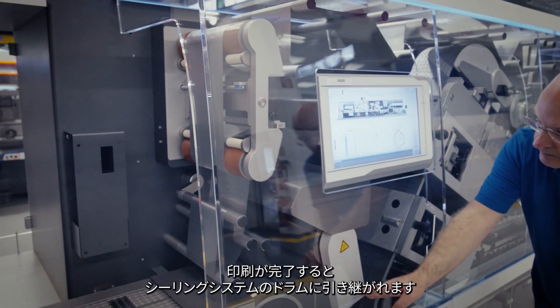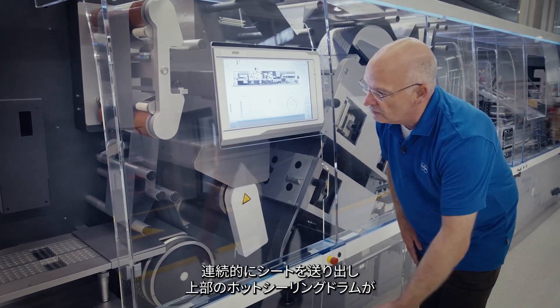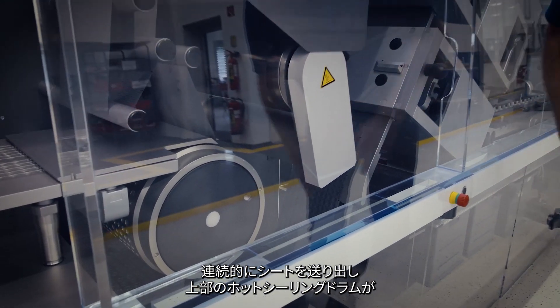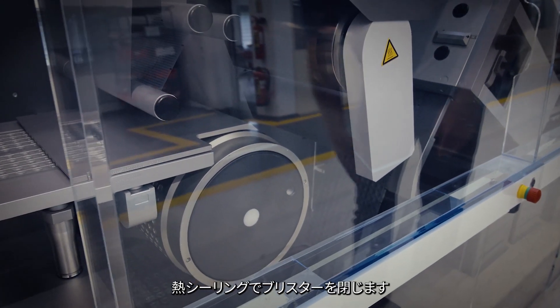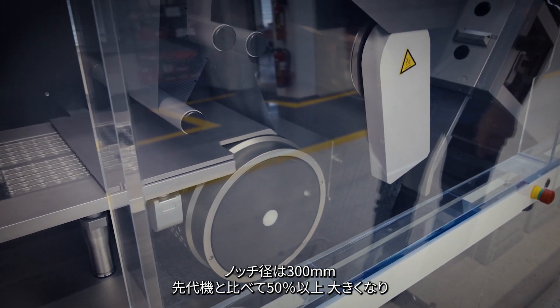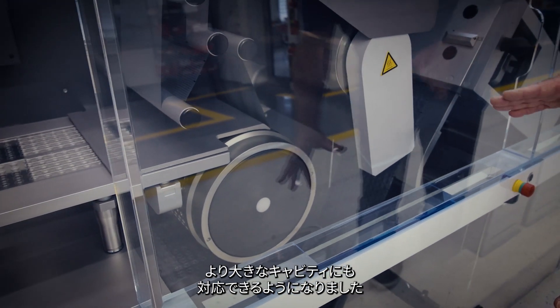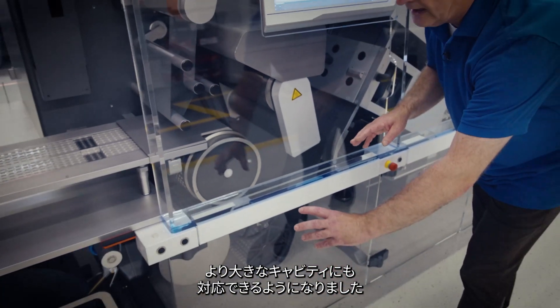Once this is completed, the drum of the sealing system takes over. It transfers the web continuously and the upper hot sealing drum closes the blister by thermal sealing. This large diameter of 300 mm is a more than 50% increase over our previous generation, and it also allows critical handling of larger cavities.